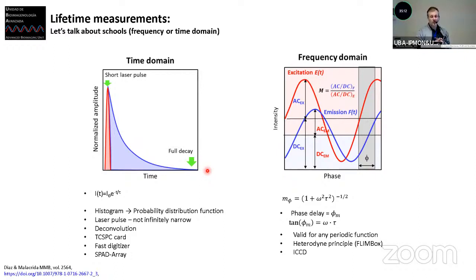And we do this process, as they mentioned, many, many times, because we have the laser pulsing very, very quickly, usually in the megahertz range, so millions of pulses per second, and we collect many, many photons in order to build this histogram. And basically we rely on fitting when we have this kind of analysis. The reason is that it's probabilistic.